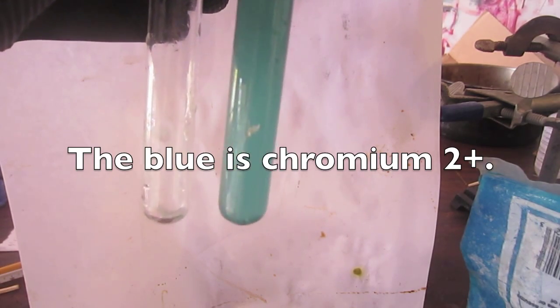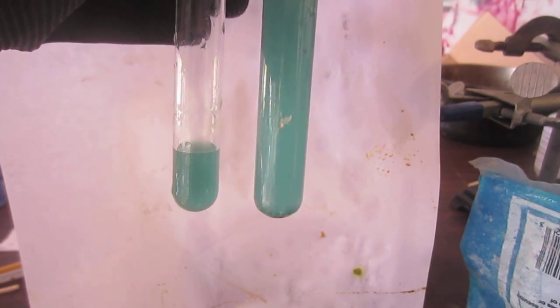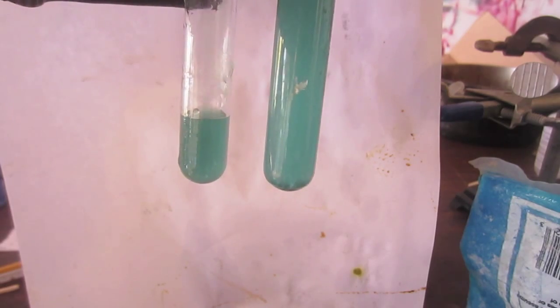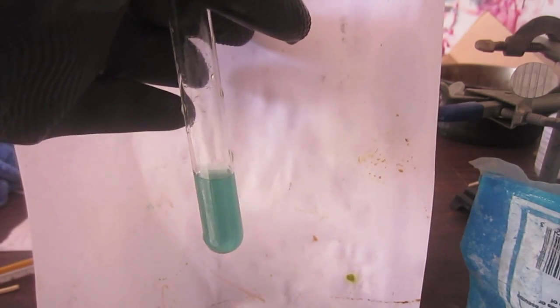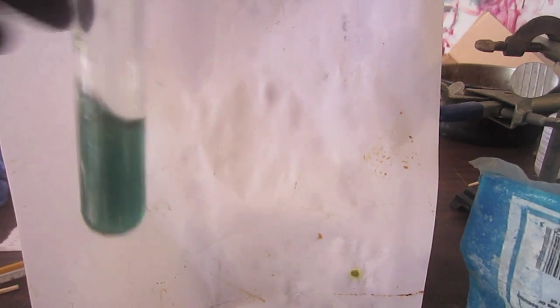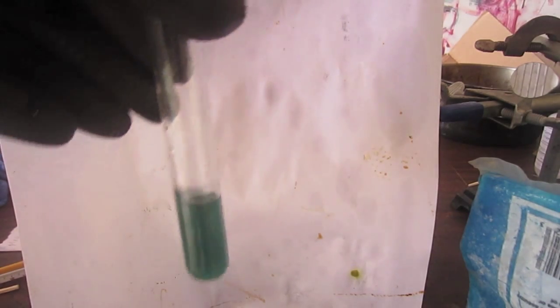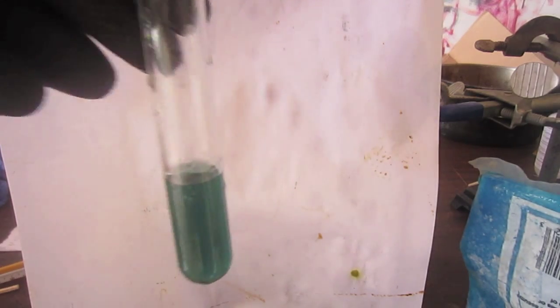And what's cool is that chromium two plus is actually quite sensitive to oxidation, very sensitive to oxidation, even by air. So here I am pipetting the chromium two plus solution into a separate test tube where it doesn't have the zinc to reduce any three plus created. When I shake it around in the air, you'll see that the blue turns quite a bit darker green. There is the original chromium three plus green solution. So there you go. You've seen two different oxidation states of chromium. Now I'll show you a couple more.